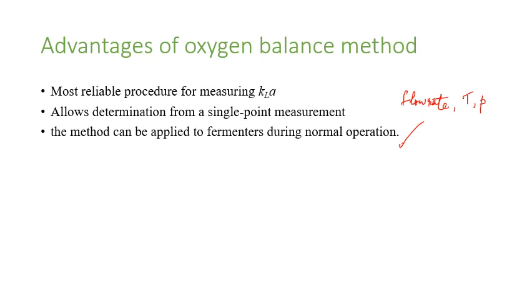Using the normal operation before you inoculate, you can use that setup to measure KLA. This method is also called a steady state method because you measure the oxygen concentrations during a steady state. Okay, so sometimes this method is called the steady state method.